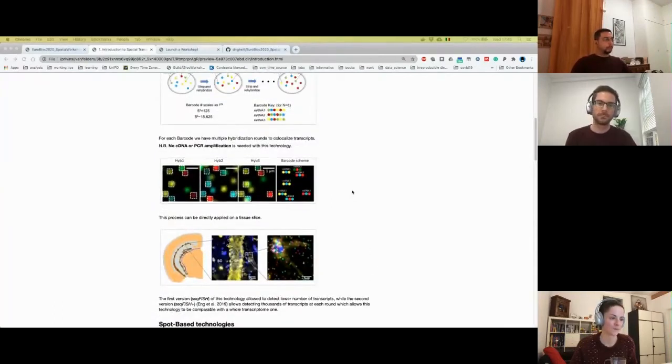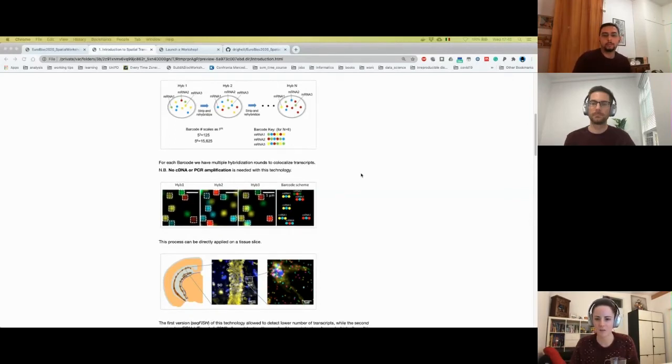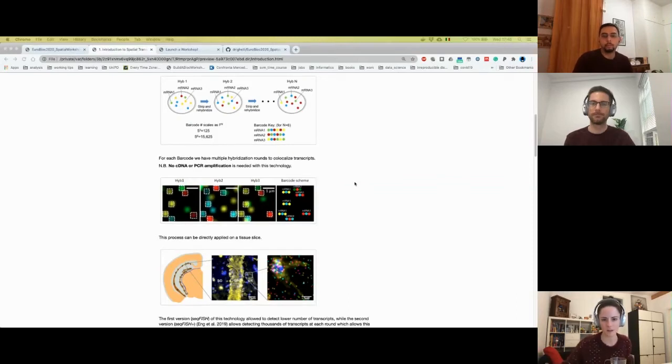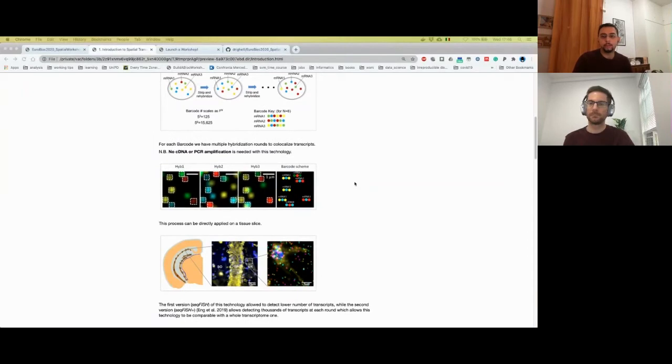I'm not sure about how to answer this question, but I think that it's up to the zoom resolution that you apply with your microscopy. But I'm not so deep inside this technology, from the bench side. I think typically with microscopy-based, they would do a DAPI staining of the nuclei, maybe, or there would be some kind of membrane staining and then segmentation. So there's a separate staining for that, maybe. I think it also provides the answer to that using DAPI and mRNA composition.